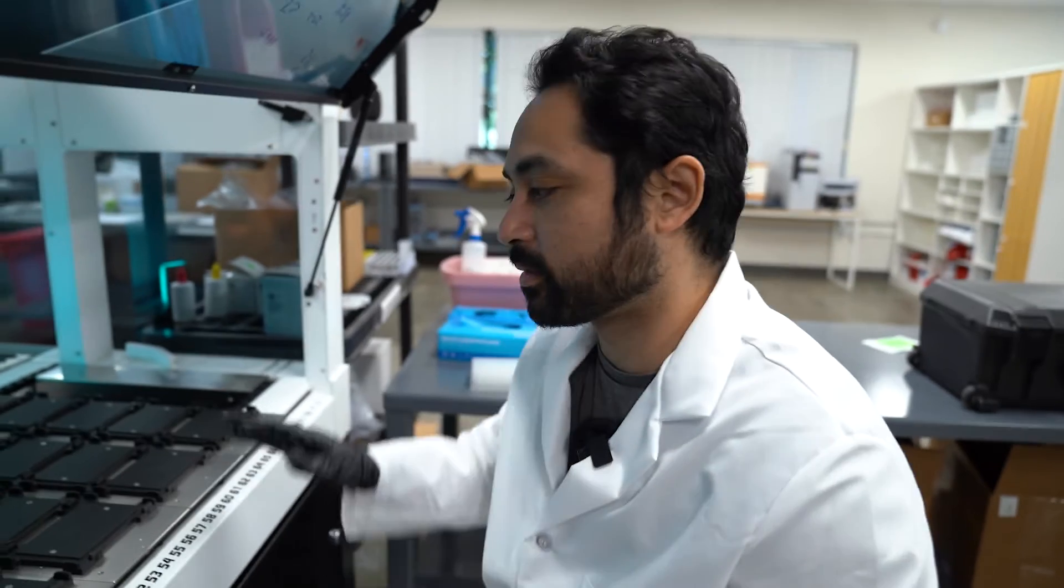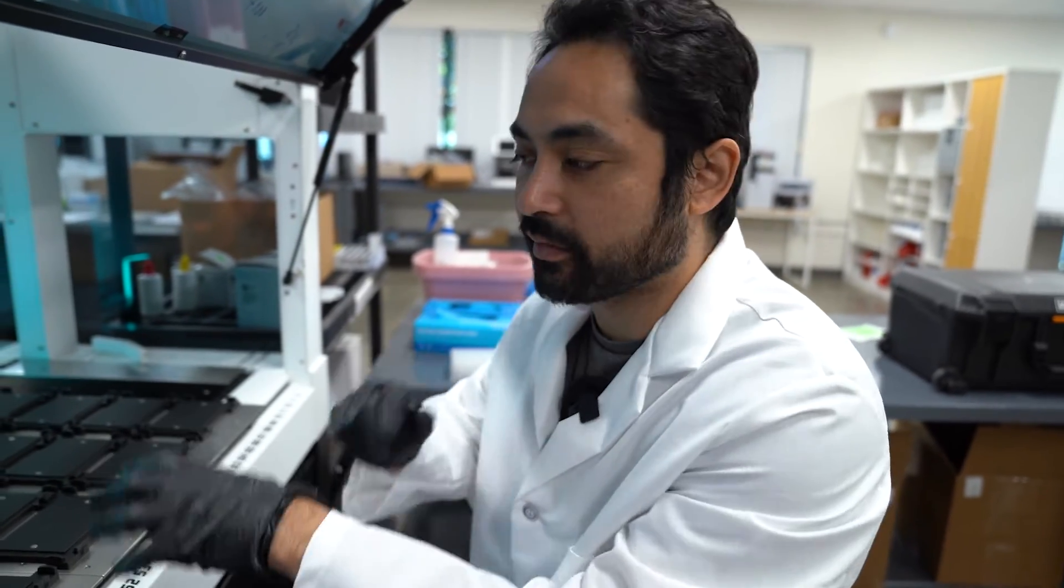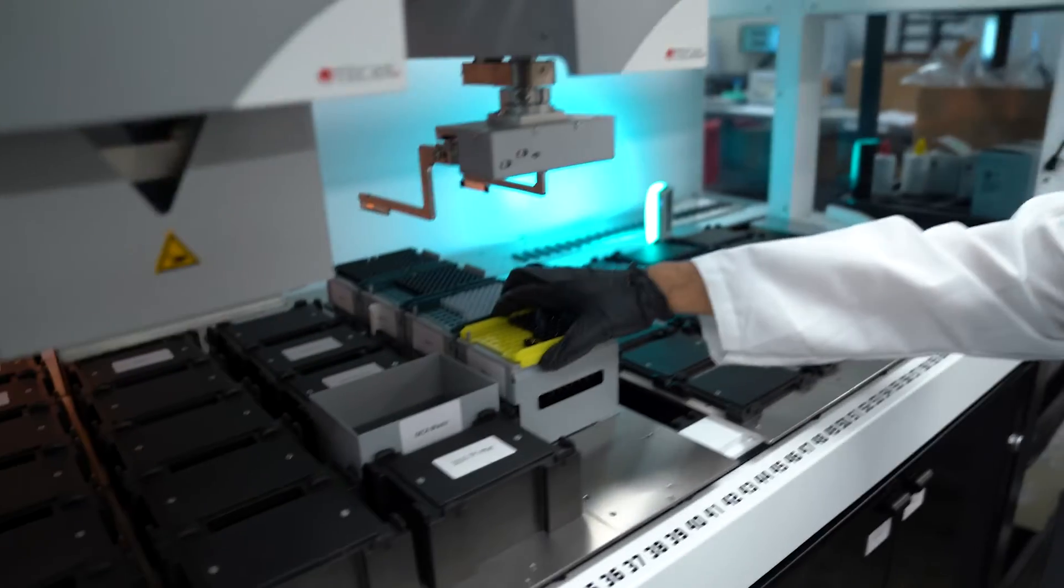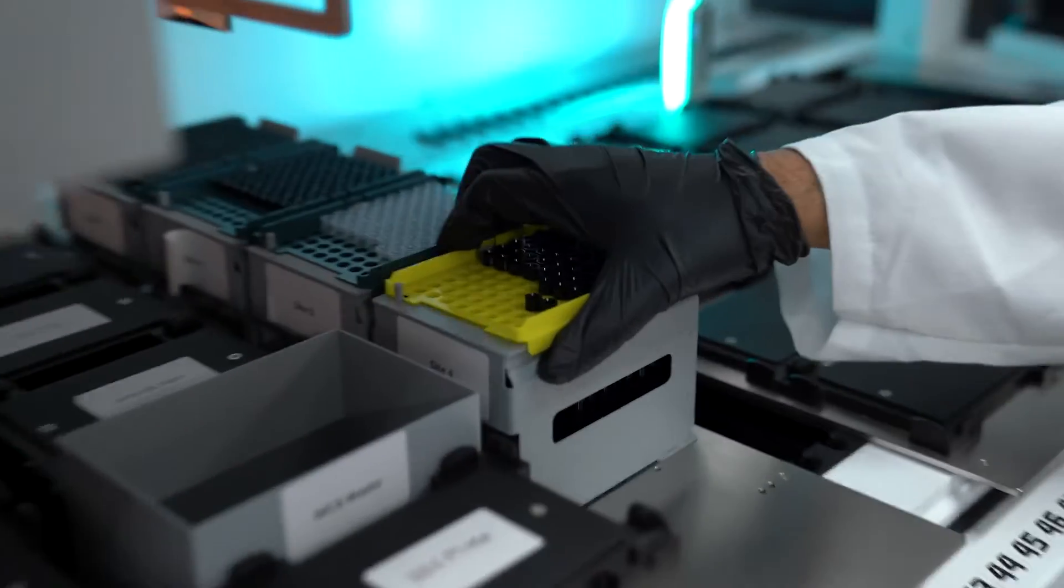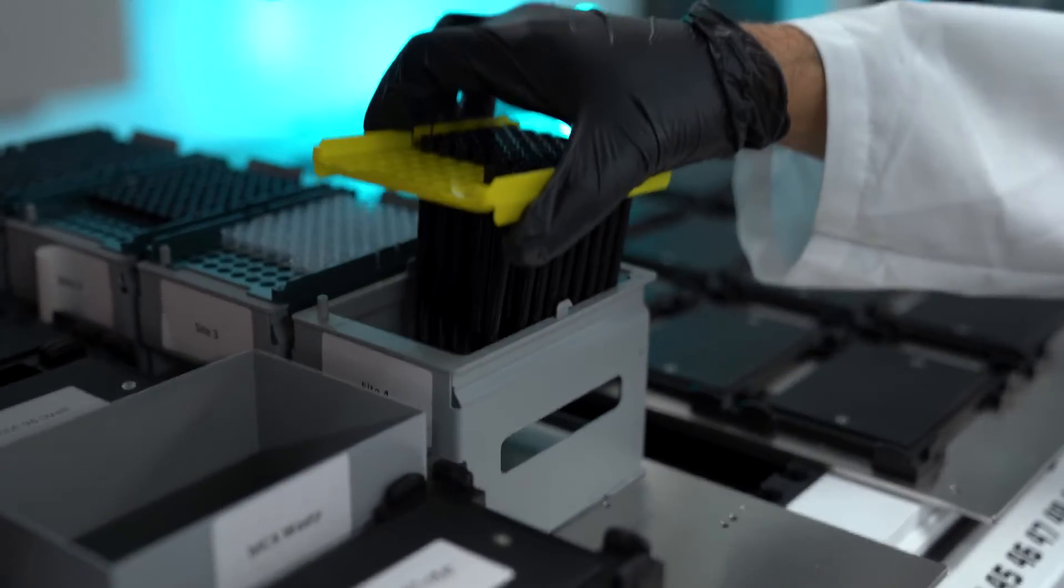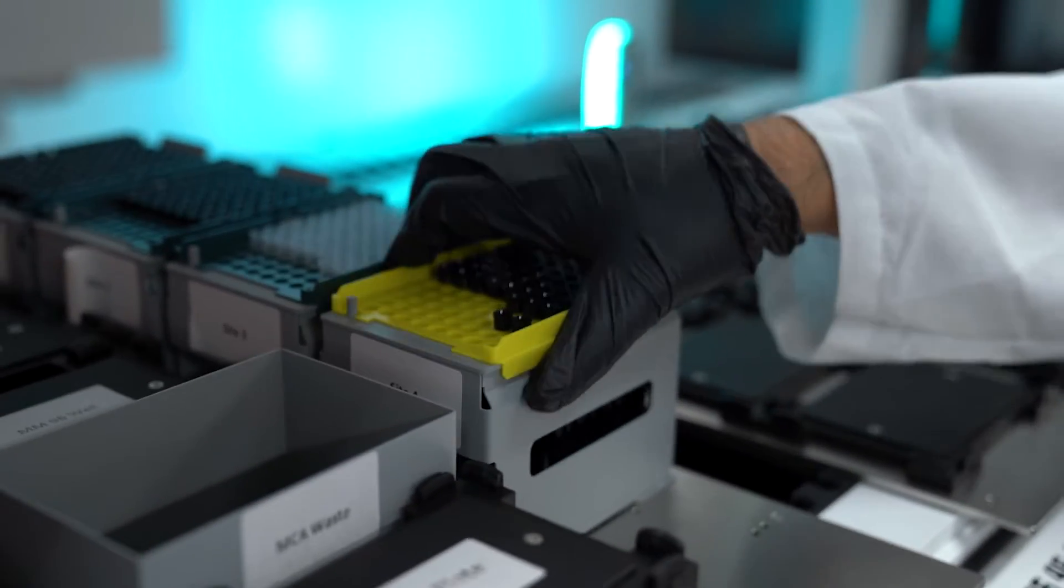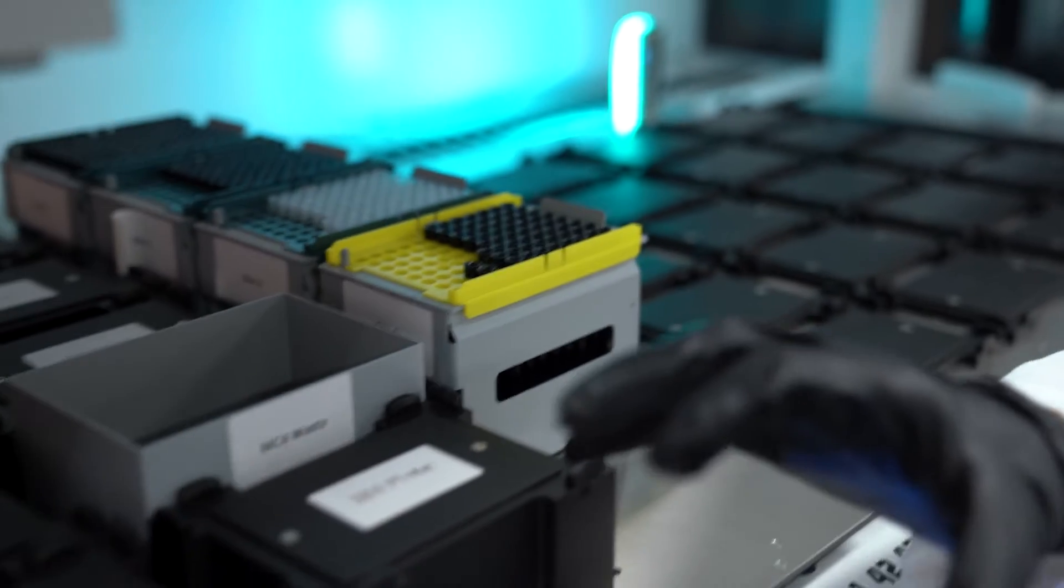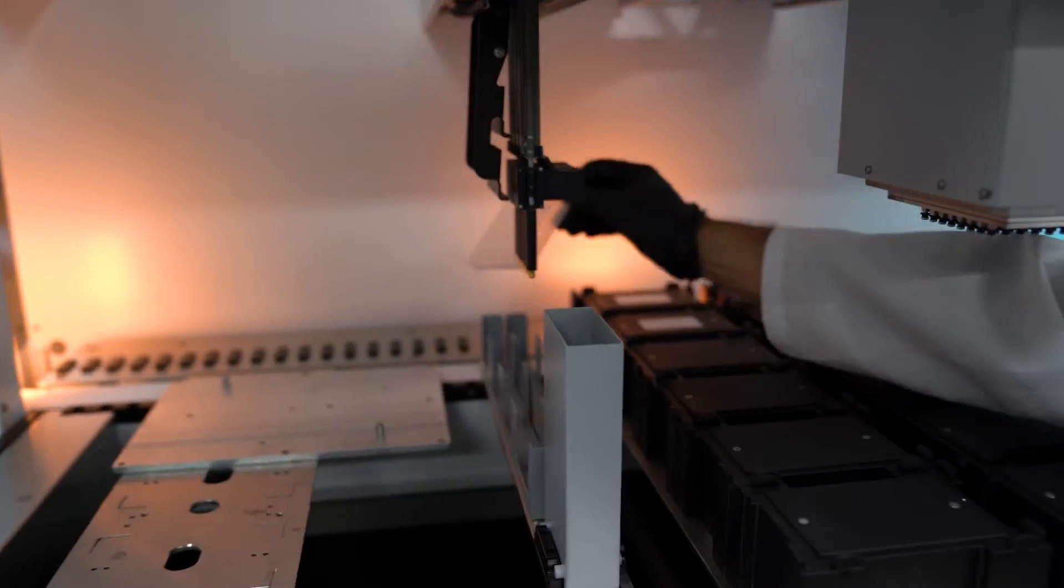So carriers are like immovable parts, right? Labware is the stuff that you put on top of it. Like, tips would be kind of like a form of labware. Like this guy would be a form of labware.